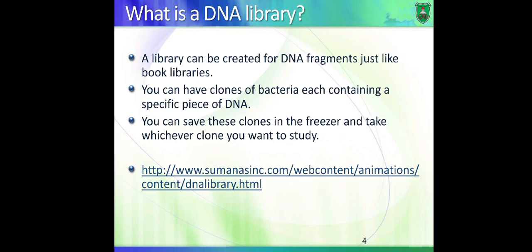So whenever I want to study a certain insert or gene, all I need to do is, since everything is organized, I go into the computer, I say I want to study this particular insert or this particular gene, and it tells me, well, go to freezer number 2, shelf number 4, box number whatever, 95, and your vial that contains the plasmid or bacteria would be present in this particular position. So I take it and I study it.